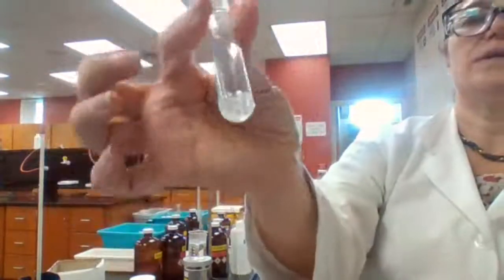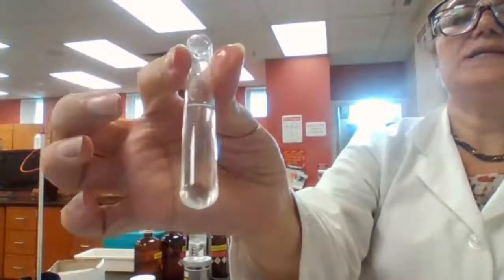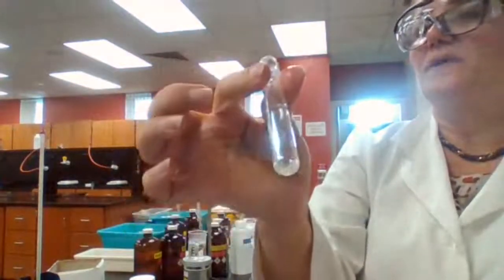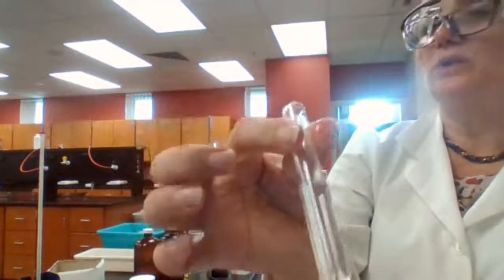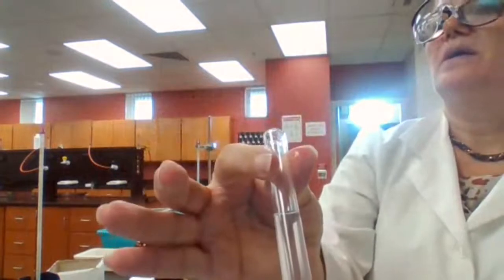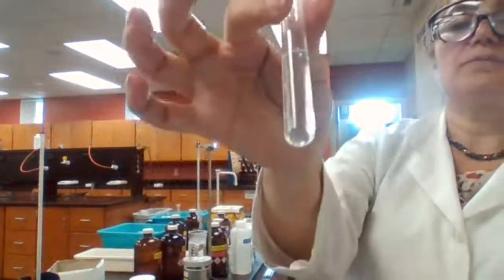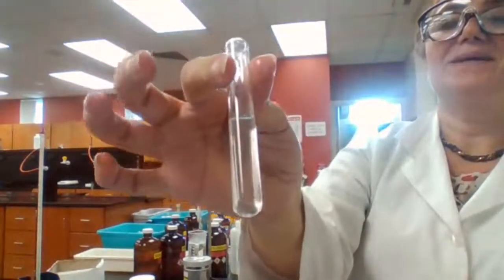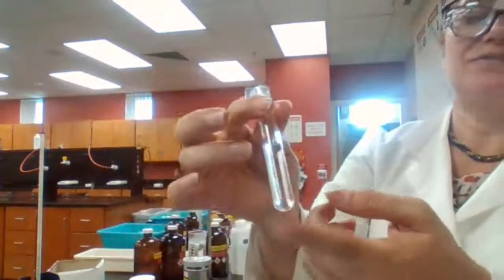Check for leftover of the solid compound. It did dissolve, yes. Since there is no solid left, this sodium sulfate is soluble in water. So the first one, sodium sulfate in water, you can record it as soluble, but please check: you don't see any solid left here.